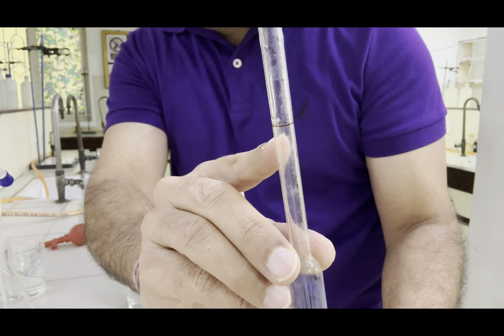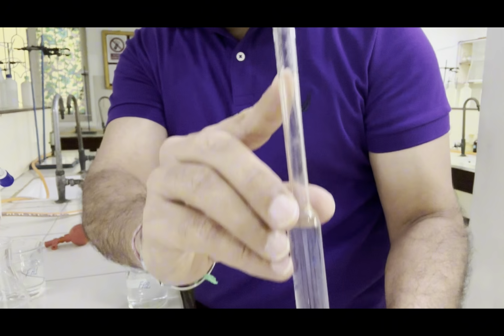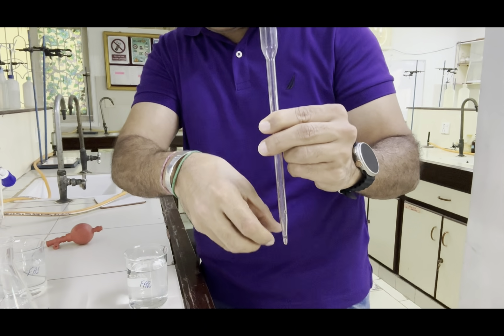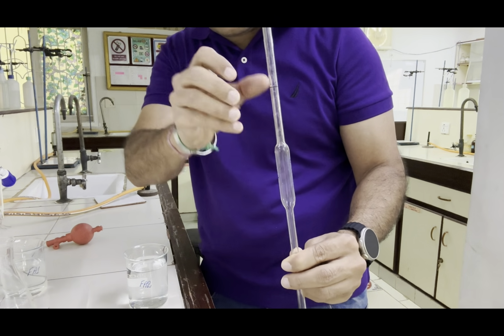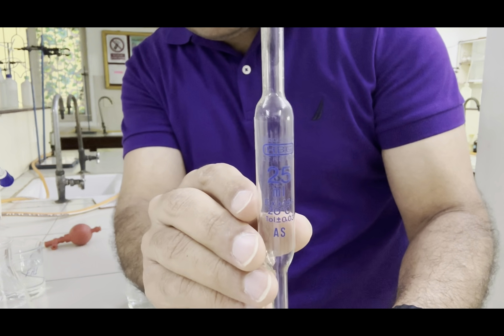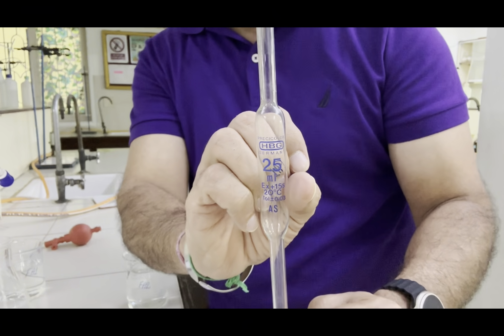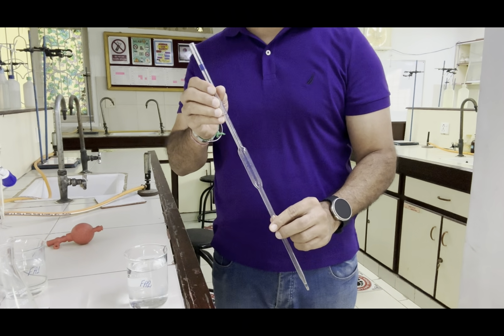Here is the mark, you can see this mark. If you fill this from here up till this mark, the volume taken will be exactly 25 centimeter cube. Now, how to use this pipette?